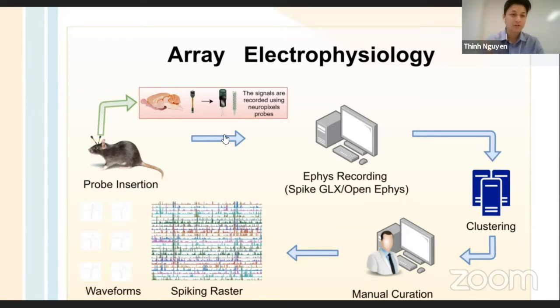With such a large number of electrodes, you get a great level of detail of neural activity recorded from any brain region of interest. And Neuropixels 2.0, recently released or soon to be released, I think, offers up to 4 shanks, and on each shank you have north of 1,000 electrode sites, from which you can select 384. So the brain coverage is much higher, and the number of potential neurons you can record from is also greater.